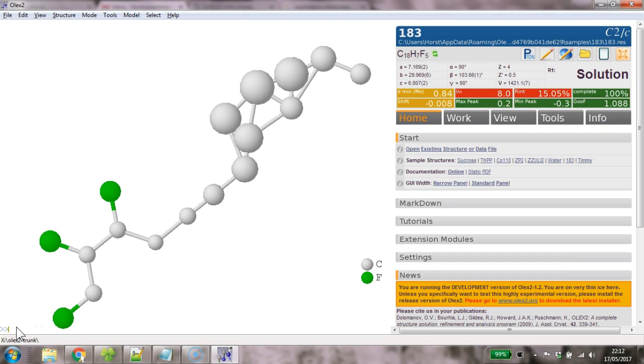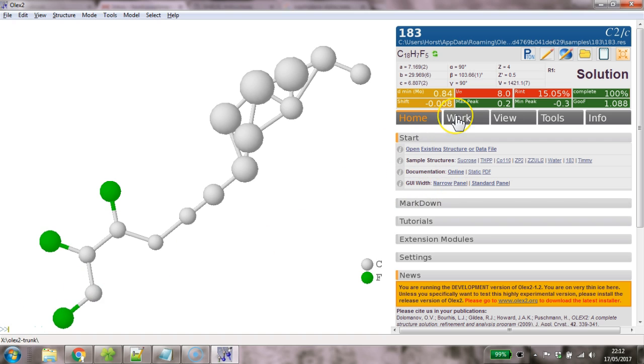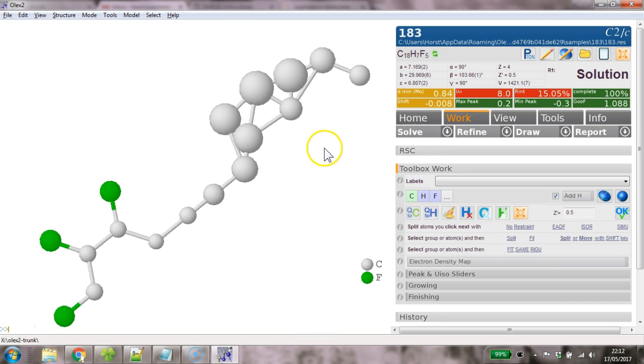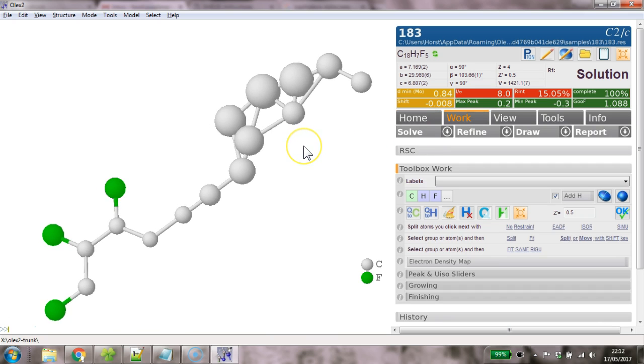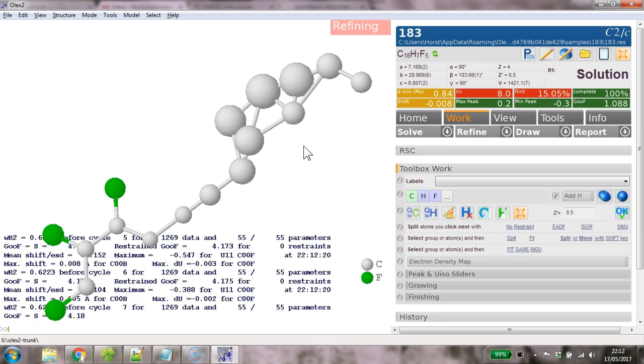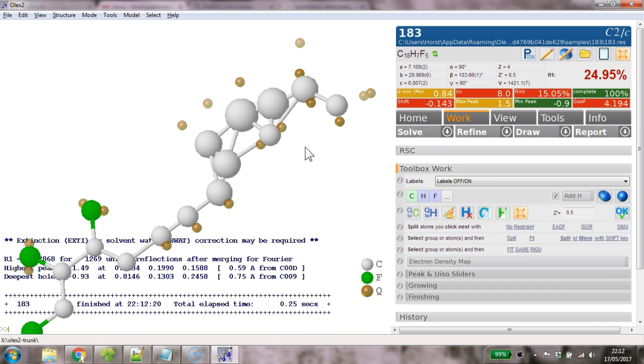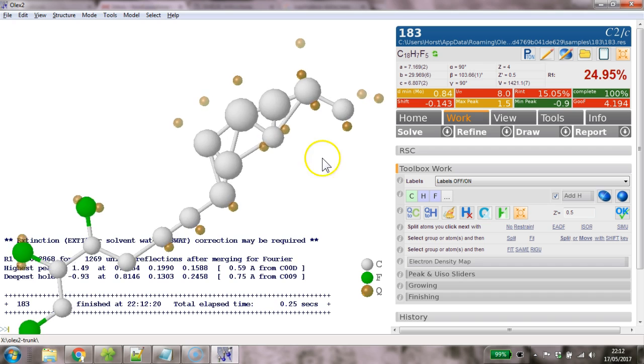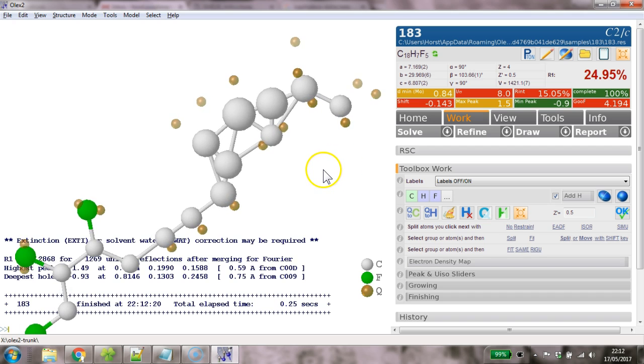Here's one that we actually ship, it's sample 183 and I've never made a video. So here we go. I've just solved this using Shell XT and sometimes it's worthwhile just giving it a little refine, just hit refine, check the things about a bit and have a look.